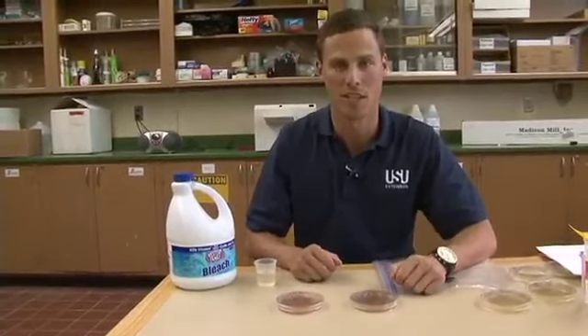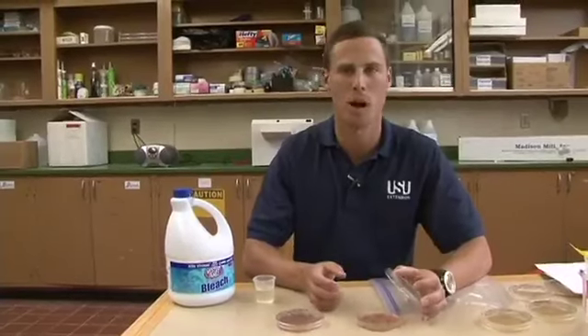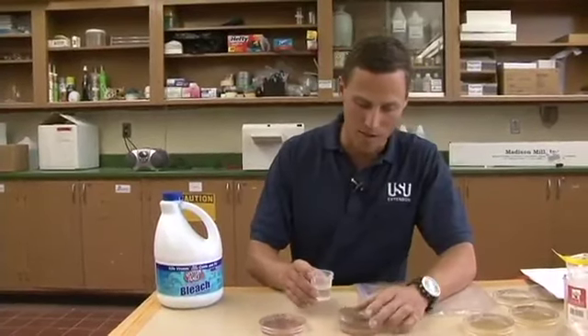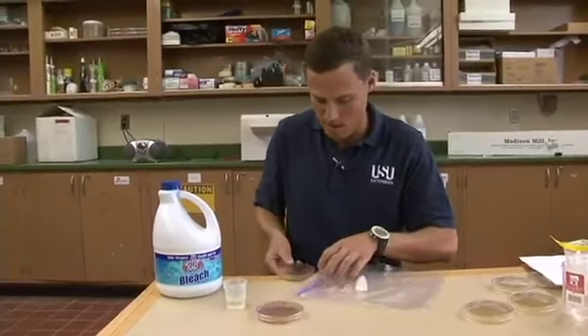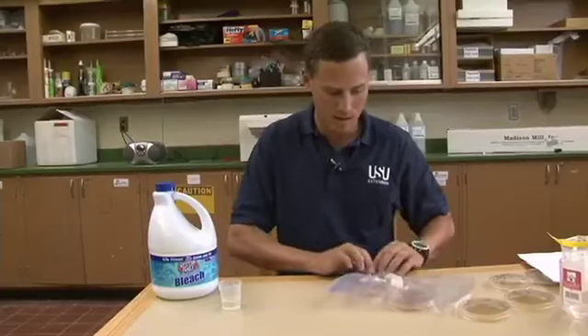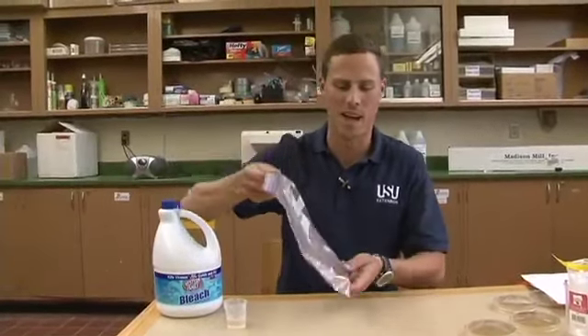Now that we've completed our monitoring for E. coli, we need to dispose of the petri dishes properly. These are not biohazards, but they are living bacteria colony cells of E. coli, so we want to properly dispose of them. You can take some household bleach, Lysol, or Clean All 409, and pour about a tablespoon of it on the surface of the E. coli petri dish for each one. Let it sit for one minute, then open them up, gently place them in a Ziploc or another sealable plastic bag, close it back up, and dispose of it in any household trash.